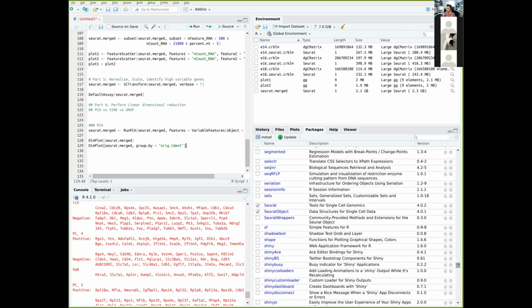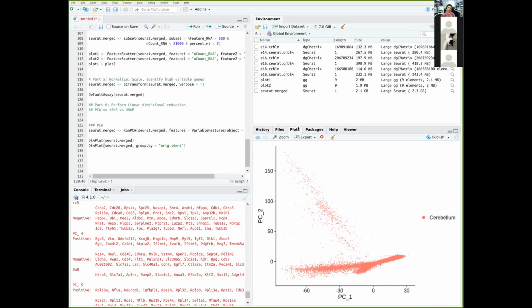Just now, I think you have the same plot. Do you have 4.0.3 as well? Yes. Okay, so then it could be that the code in 4.0.3 is slightly updated, and they changed the code so that it represents a different scale, but essentially the coordinates are the same. Yep. So it's not something dire, just a change of code, so you see a different scale but the same coordinates.